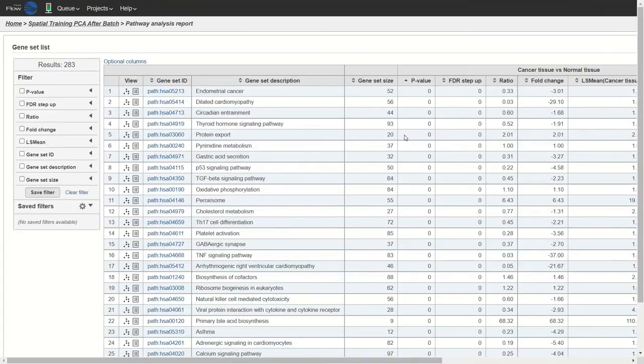Just like the gene table that we've seen a couple of minutes ago, but this time pathways are on rows, and for each pathway we get a p-value and the fold change. Now, some of these we've seen before with the enrichment, but some are new. For instance, TGF-beta. That's important because TGF-beta plays a major role in prostate cancer as it controls apoptosis and cell proliferation. Let's not forget that the chevrons are sort tools.